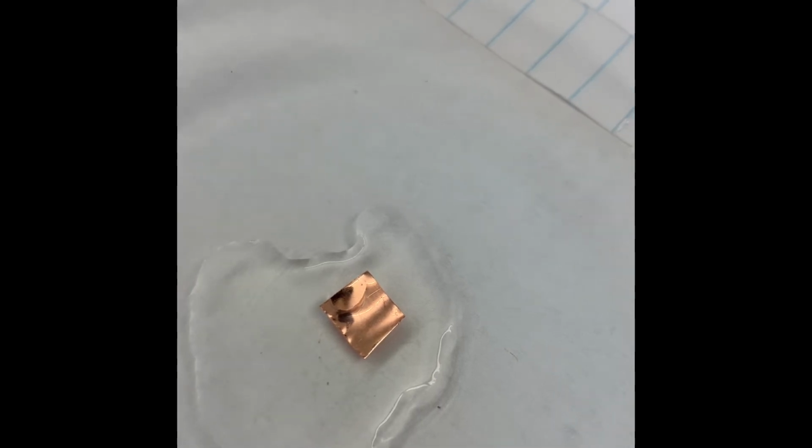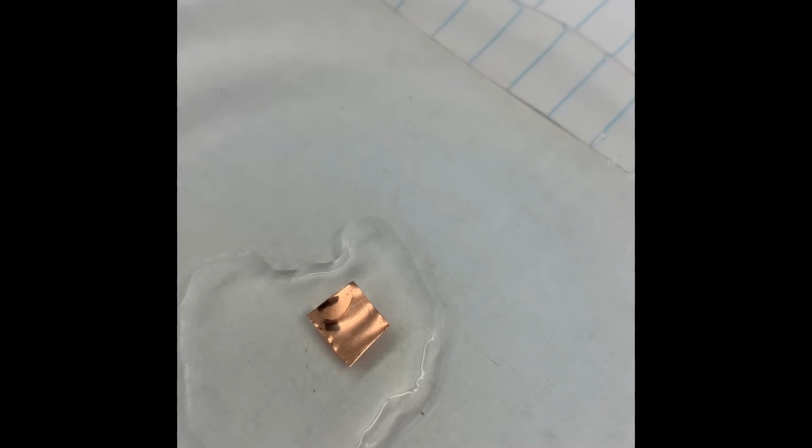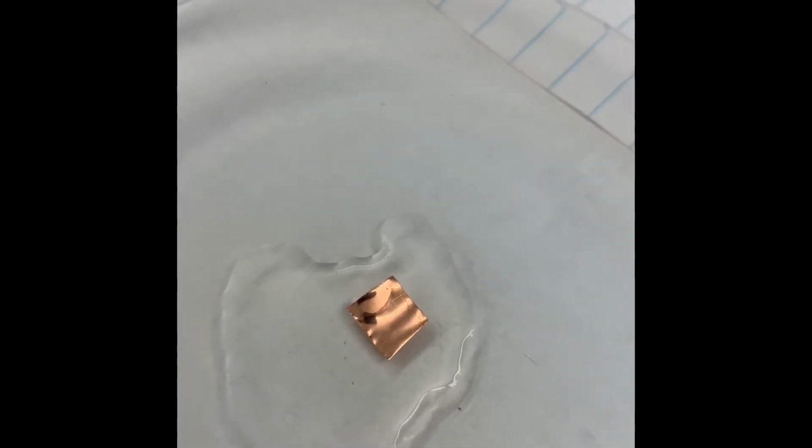If you can see that discoloration moving, it's because that's my reflection. But it doesn't look like anything's happening here.